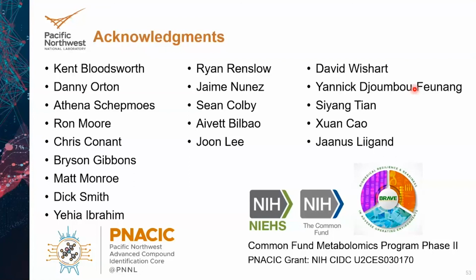I look back at what occurred in the field of proteomics. It was, I think, the early 90s when John Yates and Jimmy Eng developed the SEQUEST algorithm to identify peptides with confidence and relatively high throughput, based on the match of predicted tandem mass spectra to observed tandem mass spectra. And it seemed like a light switch in terms of the community adopting that at that time, because there was nothing else really that worked as well. And it just progressed from there. There are many algorithms now on the proteomics side, and many software tools to identify peptide sequences based on their tandem mass spectra.